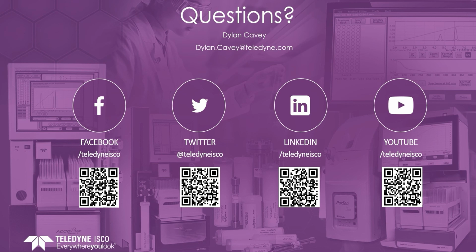Another question is, can we reuse silica columns? The short answer is going to be no. The silica surface is extremely polar, and using those strong solvents in normal phase, they're going to hold really tightly to that silica surface, so it's hard to get those ready for the next separation. You can try to extend the life of that column to two or three separations, but in separations two and three, you're not going to see the same resolution, the same separation that you did for that first initial separation.